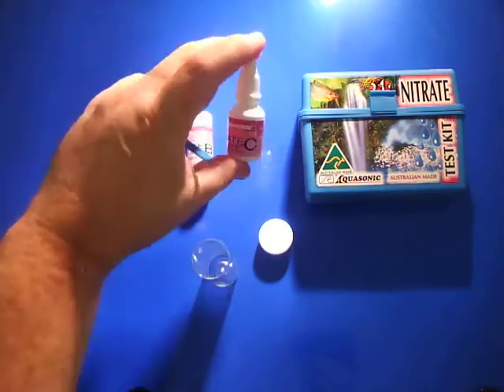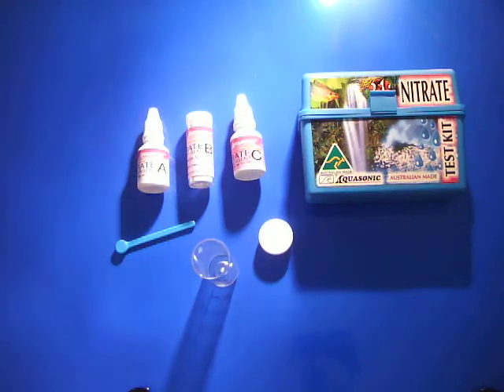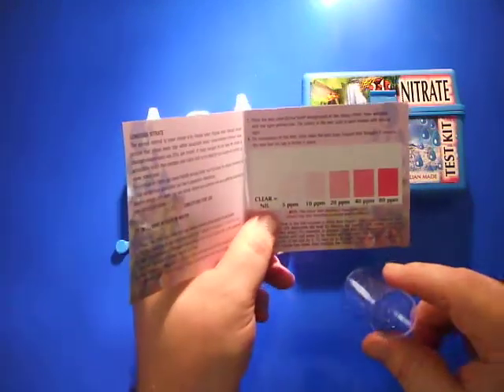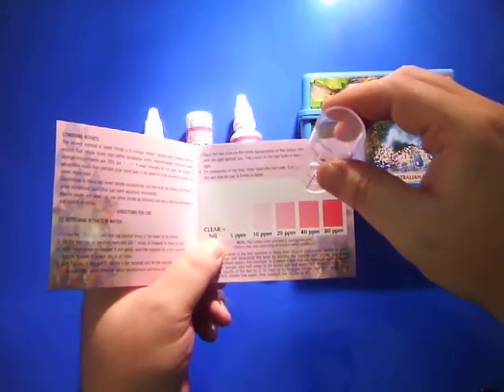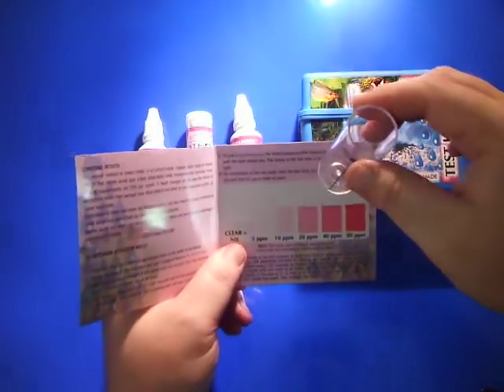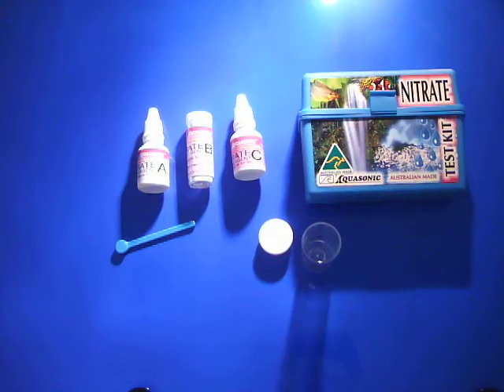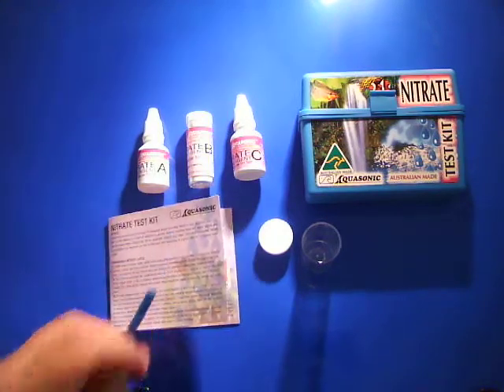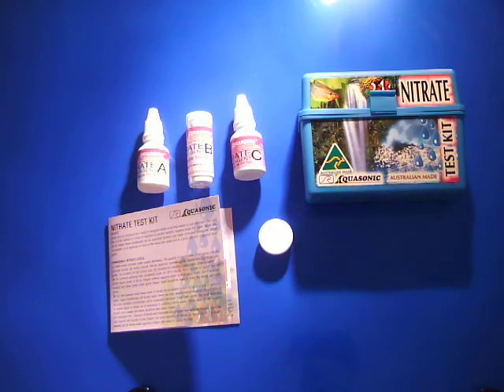Then add seven drops again, and once that's completed, you'll find it comes up with a color. You just match the color in the test tube to the color code on the card, which makes it nice and easy to use. It's a very good way of getting an idea of what your nitrate levels are in your tank.